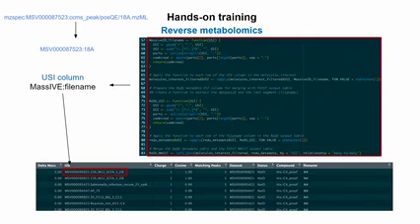When you deposit the metadata, it's at the file name level, and when you did the fast search, it's at the scan level, because it matches exactly the same MS/MS spectrum. So we just need to harmonize those two tables so we can join them together by a common identifier. What we're doing here in the second part is modifying a specific column in both tables that we call USI to make sure they're matching. Some of them will just collect the massive ID, the massive number, and the file name, and we remove all the rest that we don't need. This is done automatically by just launching these lines.